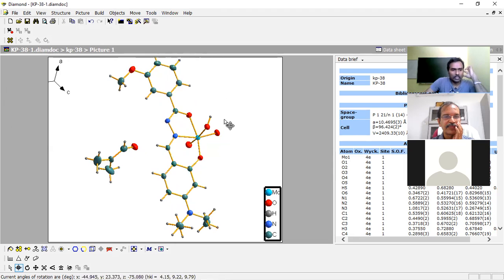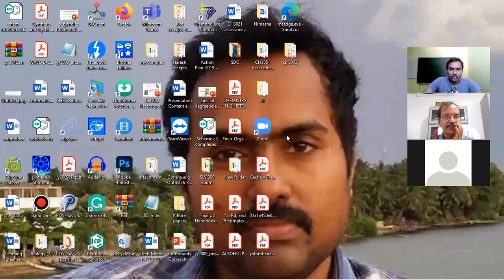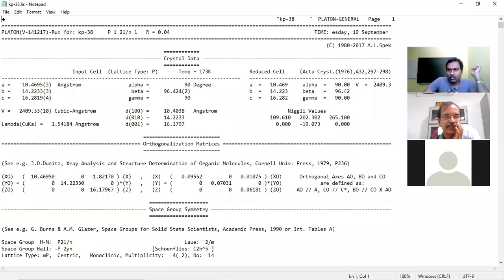So with this, now we can go to the list file. Now it is here. The list file is here. So I will just open it and see. Can you see this list file now? Yes. Okay. Yes, we can see.